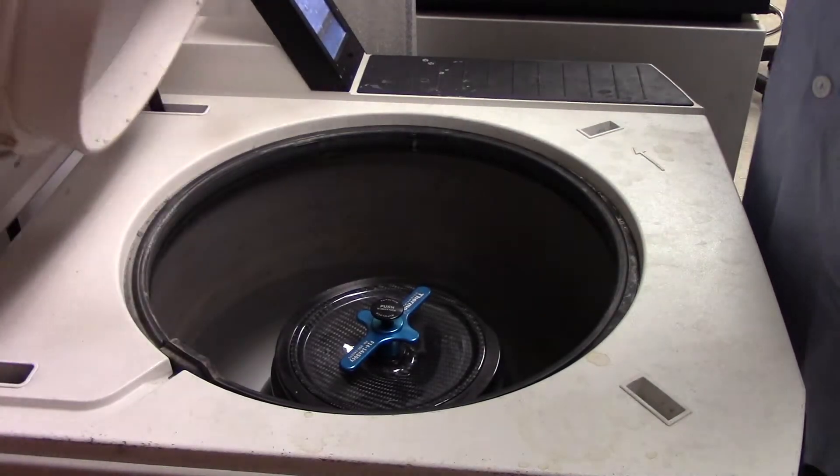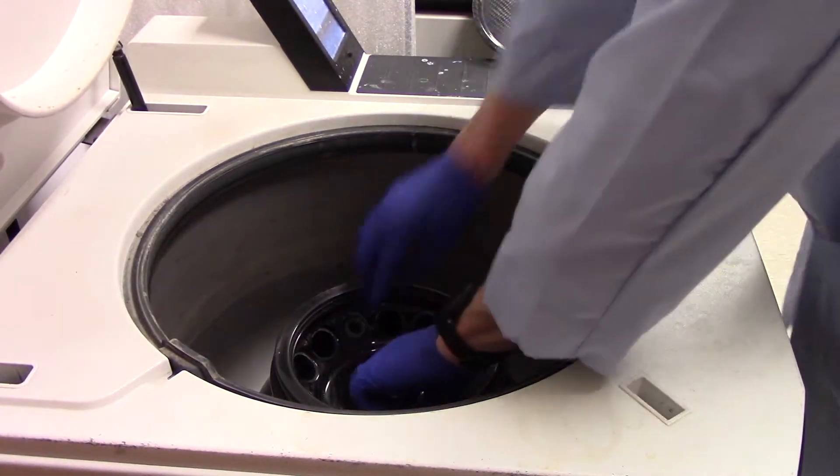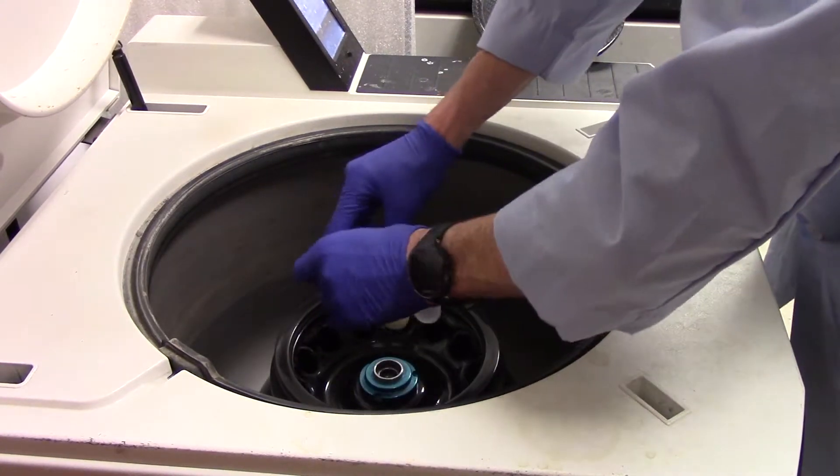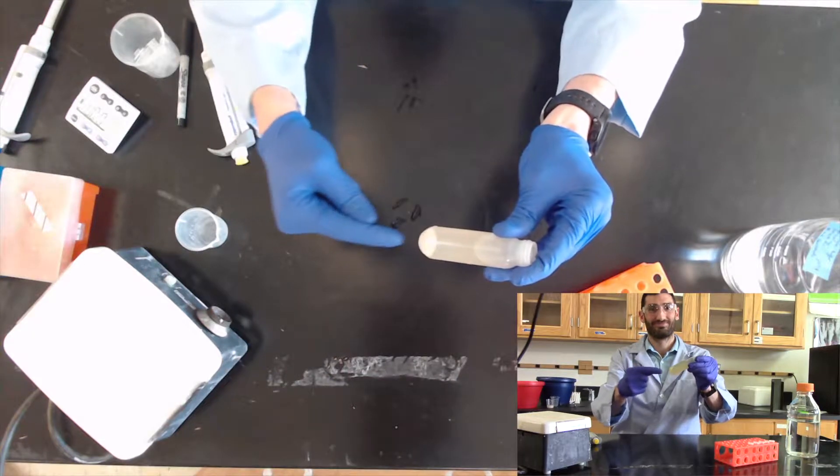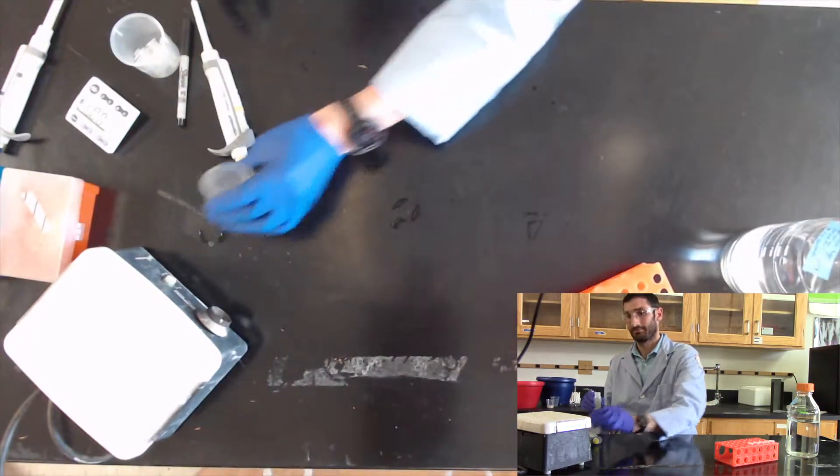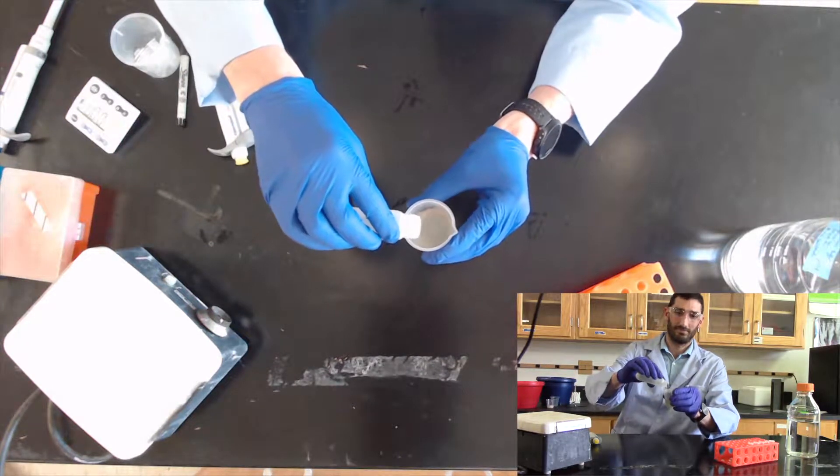When complete, open the door, remove the lid, and remove your tubes. Note the cell debris or the insoluble portion of the cells are at the bottom of the tube. Pour off the supernatant into a clean beaker.